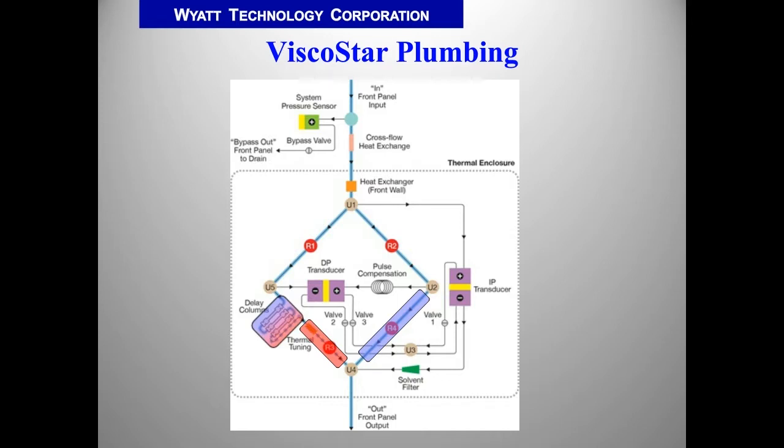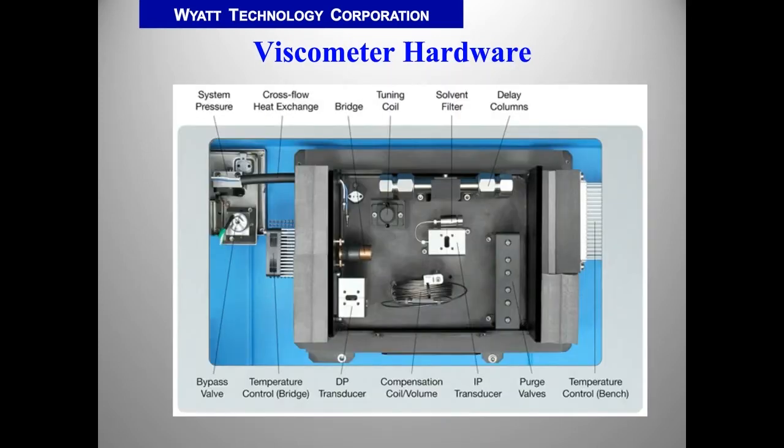Then the sample goes out of the system. And so that's what it looks like in terms of schematic. And this is what the hardware looks like. The sample comes in from the left. We have a cross-flow heat exchanger that brings it to the right temperature.